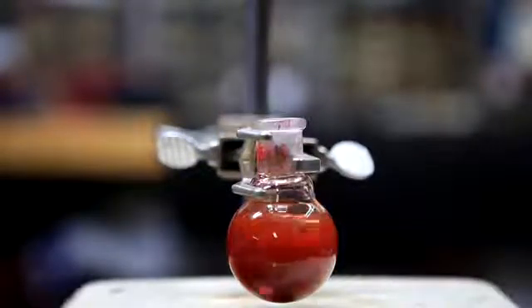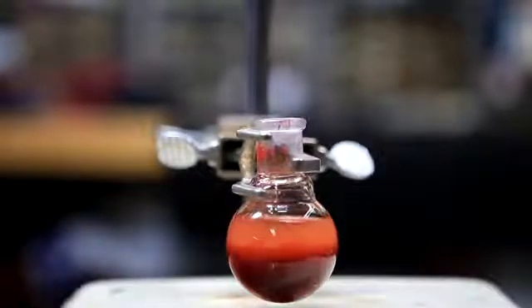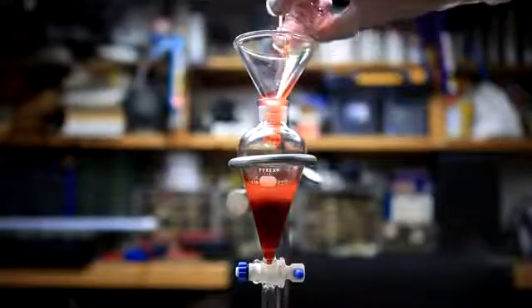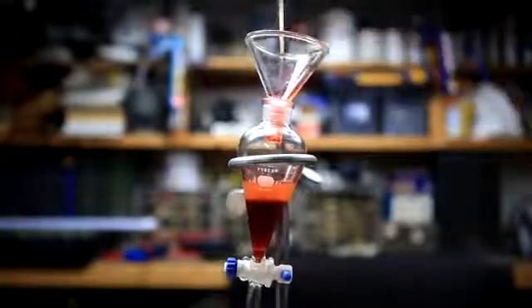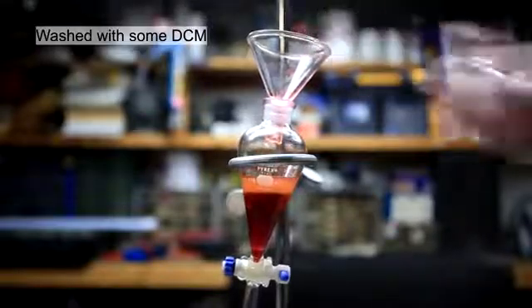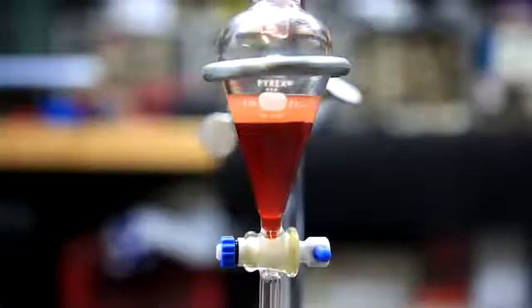When the stirring stopped, it quickly reverted to a two-phase mixture. This mixture was then transferred to a small separatory funnel. The round bottom flask was washed with a couple milliliters of DCM. The contents were mixed thoroughly and then the layers were allowed to separate.